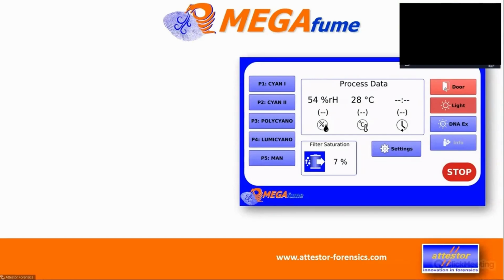And then as a result, the system will calculate, okay, this run represents, let's say, 0.7% of saturation. And then it simply counts up. When it comes to 90%, that field changes the color into red, and you get a display saying, oh, you're at 90% saturation, make sure you have some replacement in-house or something like this.